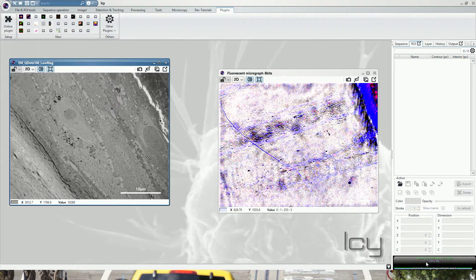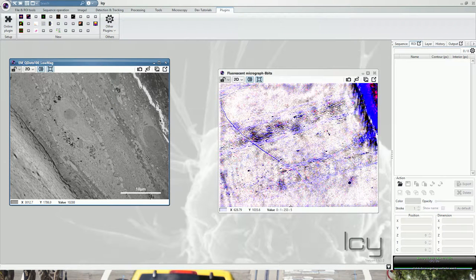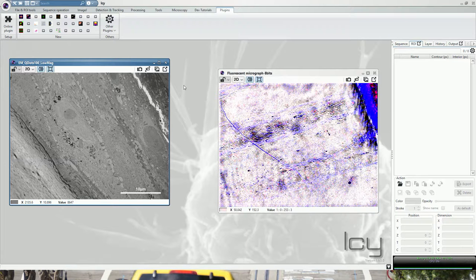Welcome to this first tutorial on how to use EC-CLEM. First, start by opening two images to correlate together.